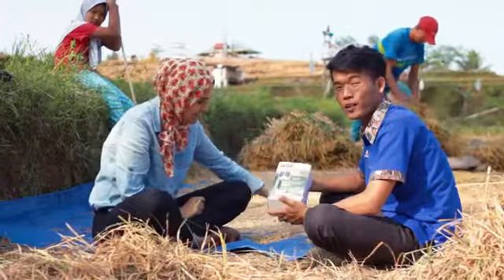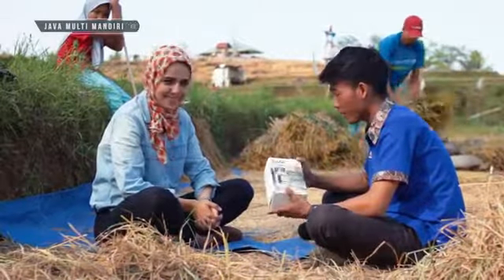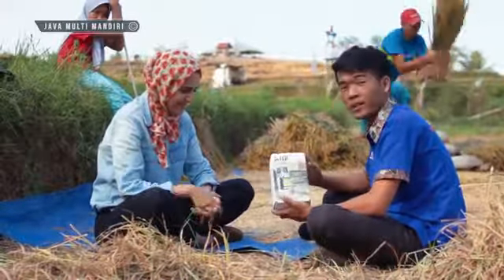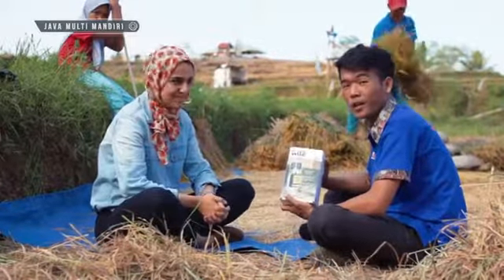Kali ini saya akan melakukan pengujian kadar air pada biji gabah dan biji lainnya, menggunakan alat mostumeter seri Wild 55. Alat ini berfungsi untuk mengukur kadar air pada biji ujian.